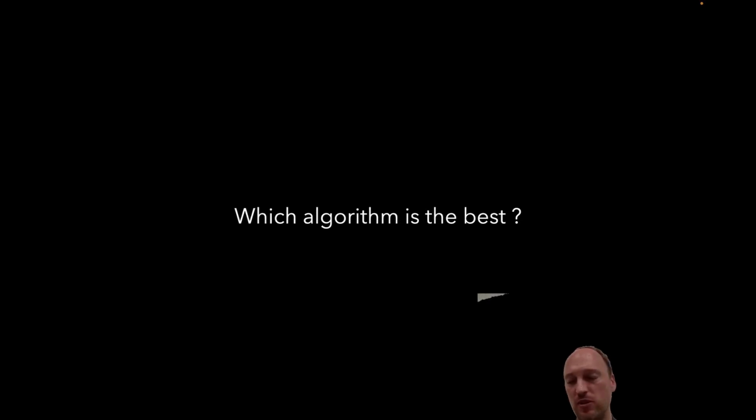What's the content of the images? Is it sparse? Is it very uniform? Do you have high frequencies in your images? Do you have low frequencies? There are so many characteristics of the instruments that acquire the image, of the thing that you're looking with the instrument. There's so many things to consider that actually the better question is perhaps which algorithm to choose for the images coming from your instrument.